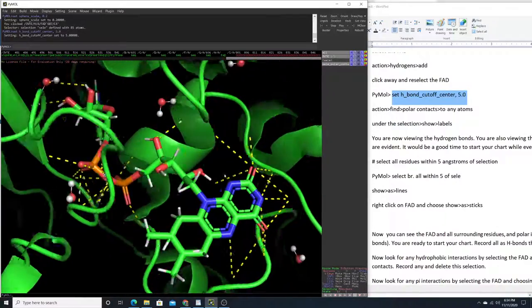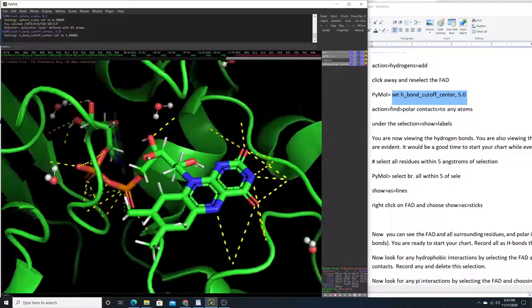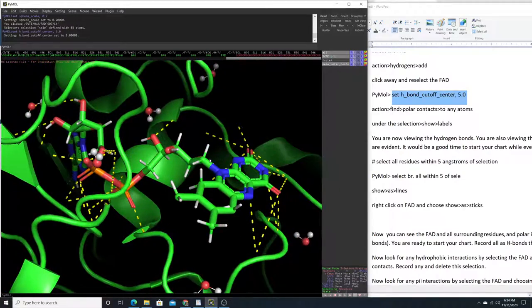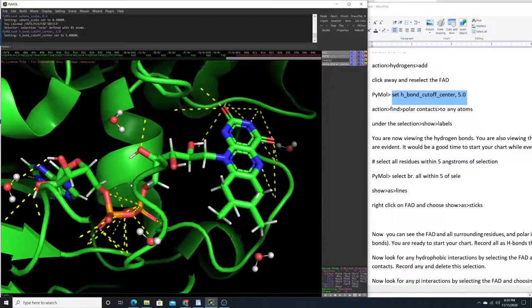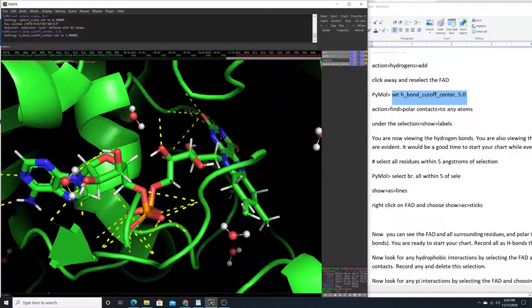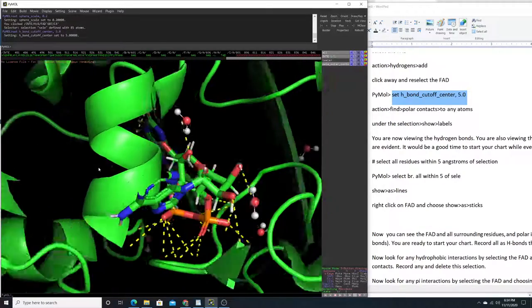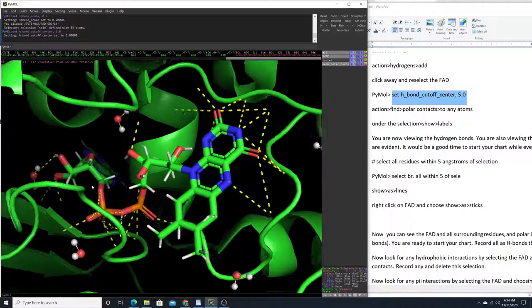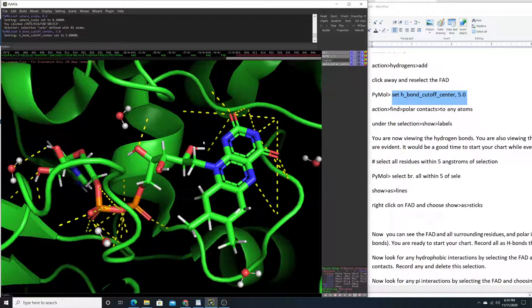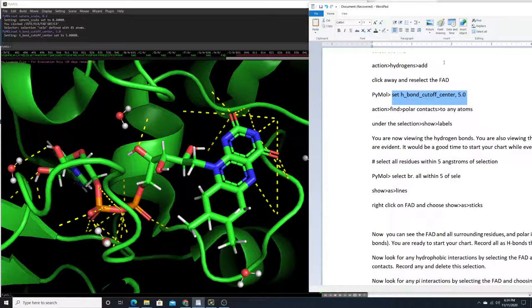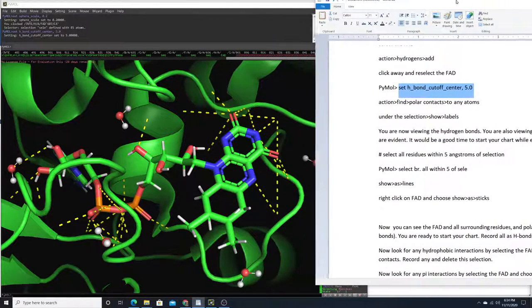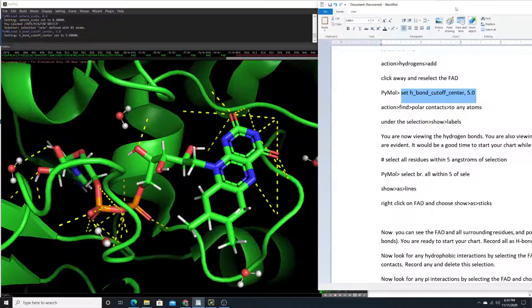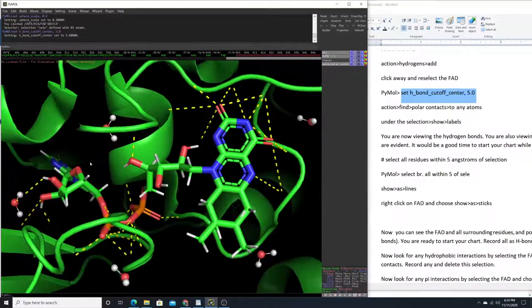Now you can view all of the hydrogen bonds that exist between the ligand and any other atoms. Notice there are some hydrogen bonds to at least one water — we have a couple of those. We also have hydrogen bonds to some of the side chains or backbones, but we can't see those yet, so we want to be able to view those as well.